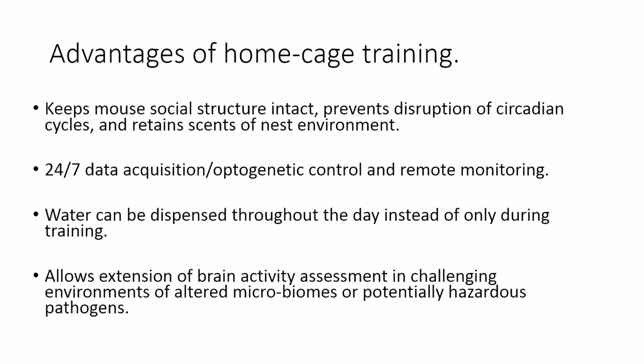They keep their nest, all that. Of course, we can collect data 24 hours a day or photostimulate, inhibit. Another thing is the water is dispensed throughout the day instead of only during the training, which is potentially an advantage. And you could also use it in really challenging environments.